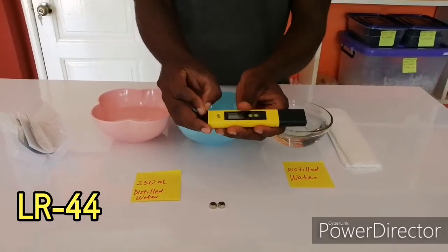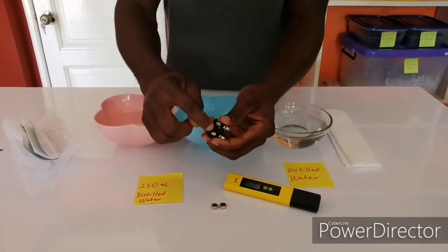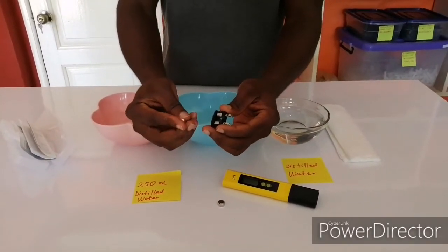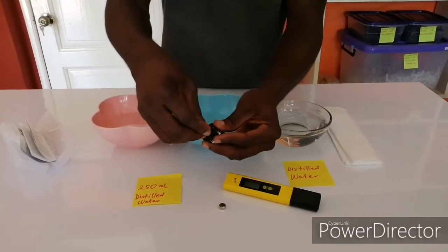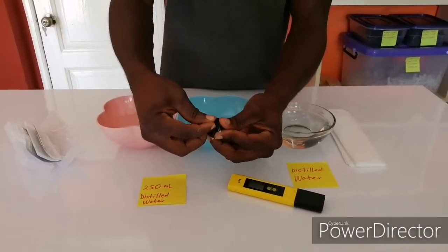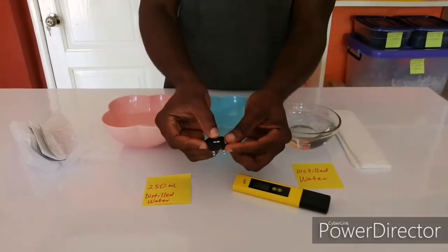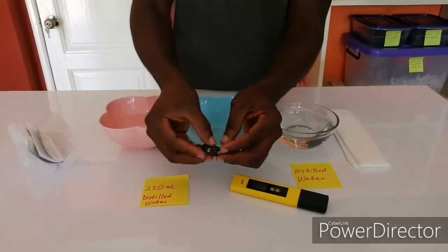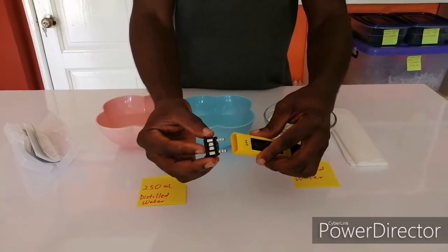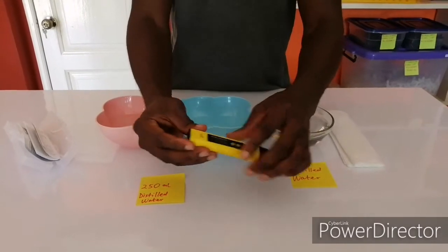This is how you put in your battery. You bring this out, and then it's indicated positive and negative. This is the positive side of the battery, so it goes in like this, and then also like this. And then you push it in. If you want to take the battery out, you just turn it and then push them out from here. The higher parts of the pins go inside.